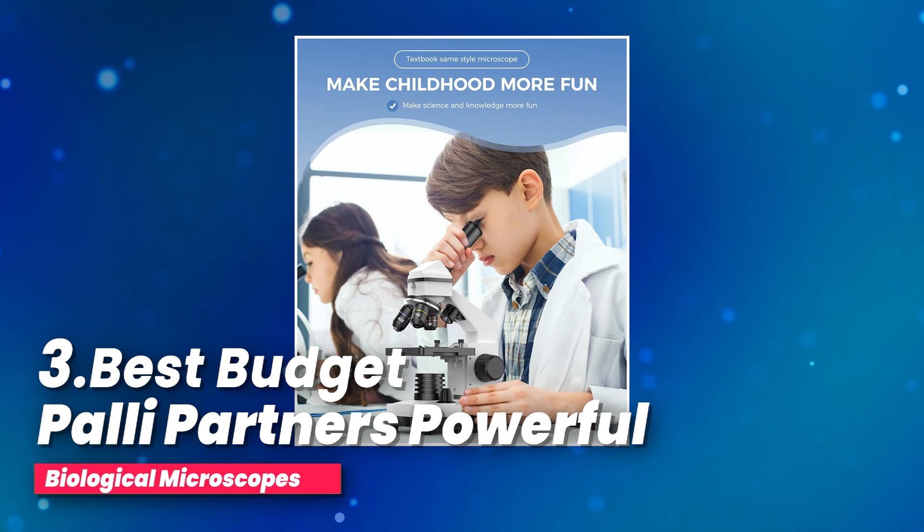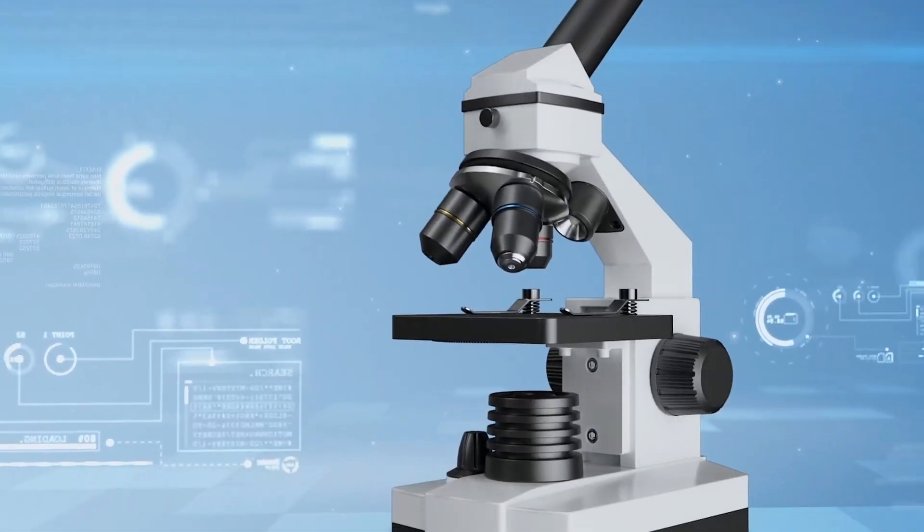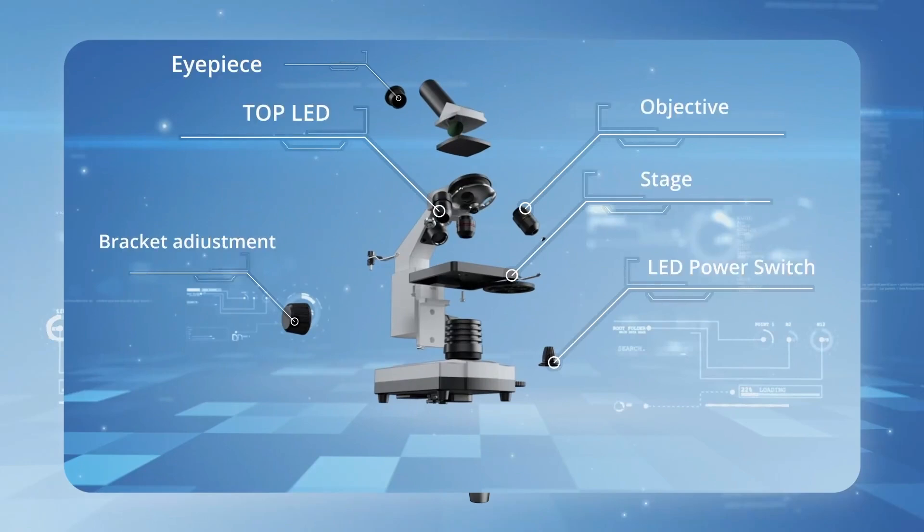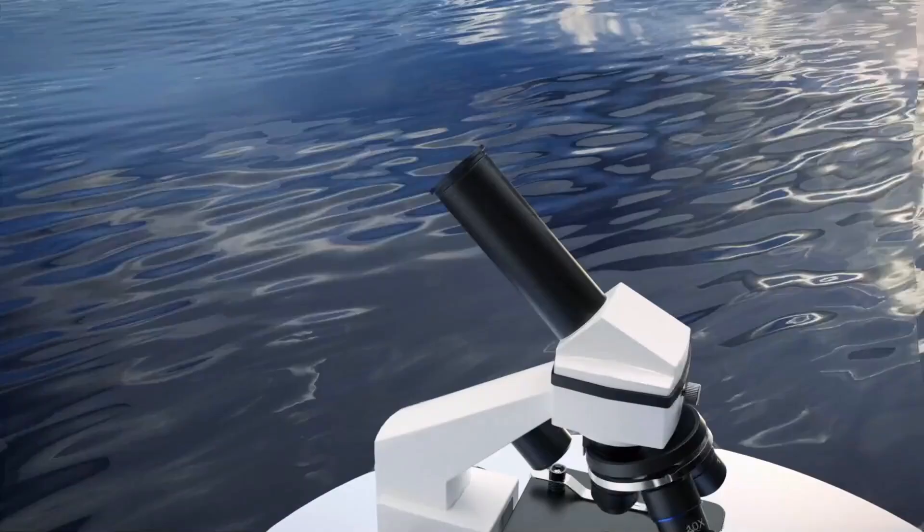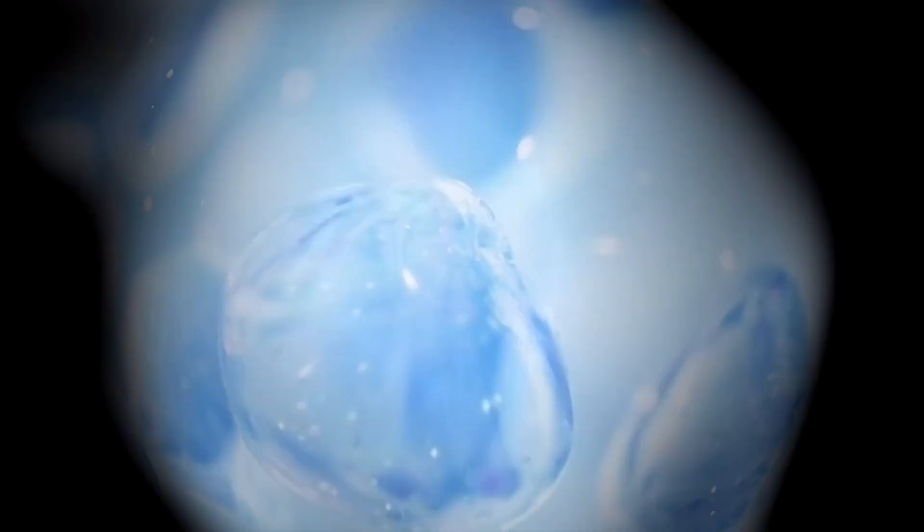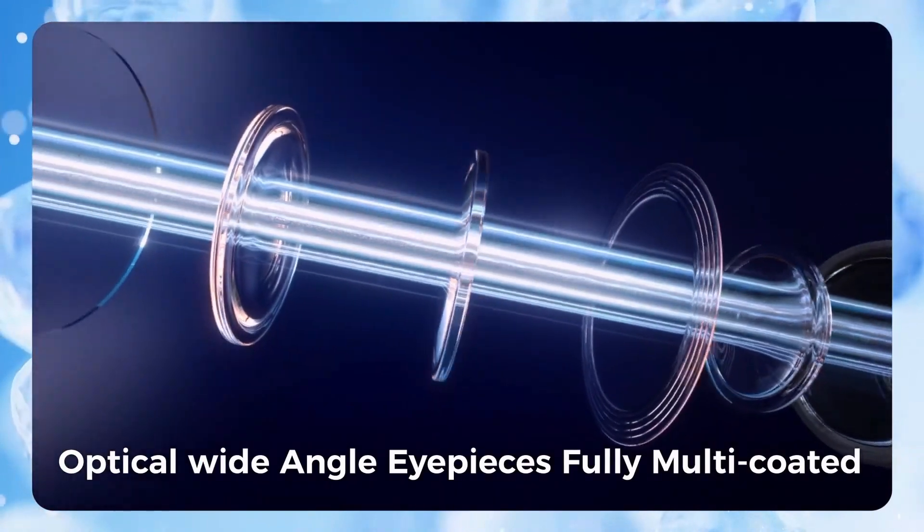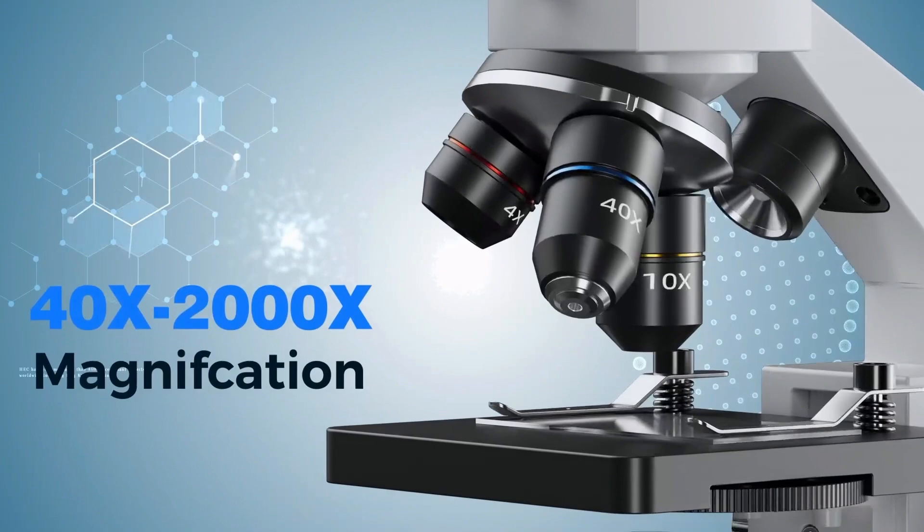Number three, best budget: Palli Partners powerful biological microscopes. Looking for a powerful microscope that brings the tiny details of the world into sharp focus? Look no further. This high magnification model features a WF-25X eyepiece, which can be used alone or paired with a 2X lens. When you combine this with its 4X, 10X, and 40X objective lenses, you'll enjoy an impressive six different magnification options.